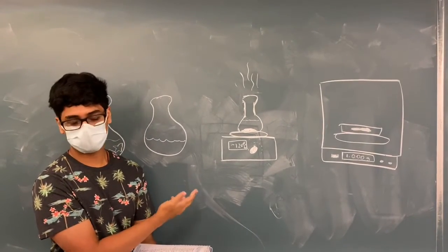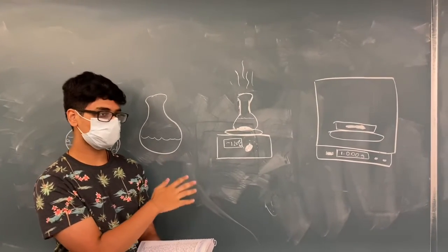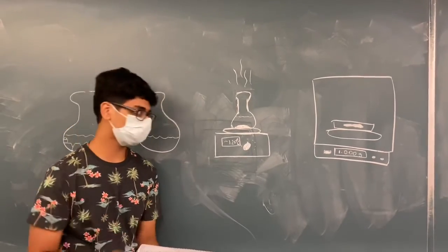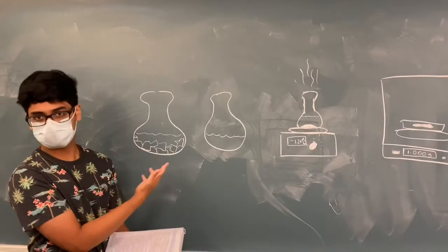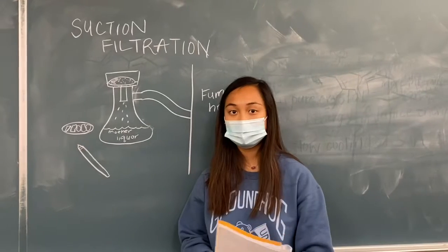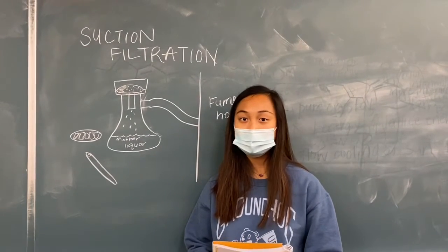It may take some time for it to cool down, so essentially, when you touch the surface of the flask, there should be no heat present. After that, you should be observing some formation of crystals. Once it reaches room temperature, they'll be lying along the bottom edge. So the objective of this lab is to get 50% recovery of the acetanilide crystals.